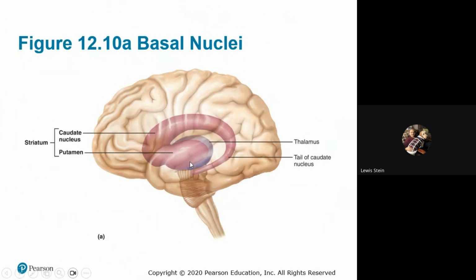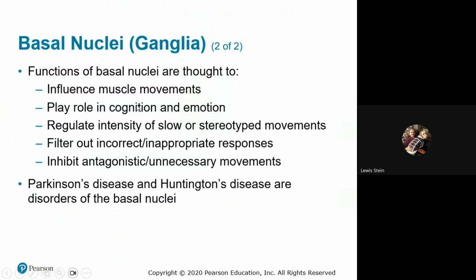As you open up the brain, you won't see this, but you'll see evidence inside the little cleft in that large lateral ventricle where you see some of that gray matter. That's what that is. And now you begin to see behind it. Now we're getting lower. This is the thalamus, diencephalon, and that's the one large structure. The others are very tiny in the sheep. Now this is the medulla, the pons. You can see the fibers go transversely, and this is the midbrain area. And all of these things: muscle movement, cognition, this is where Parkinson's and Huntington's disease come in.